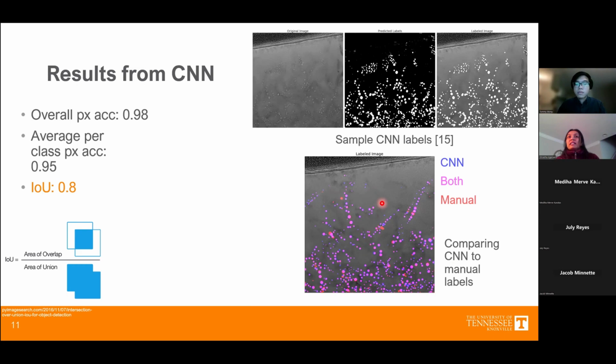However, other advanced papers are comparing object-wise. So what they do is, whatever masks that you provided in terms of white pixels, they are taking it as one object. And then they are comparing it. So that is known as object-wise comparison.